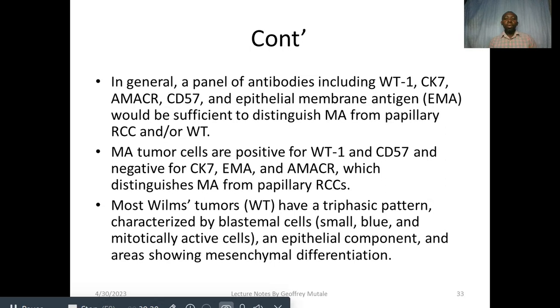So these are other auxiliary tests which can be done to make a distinction between these cells, as cytologically they may present with similar features or may draw inconclusive diagnoses, but we need to conclude.